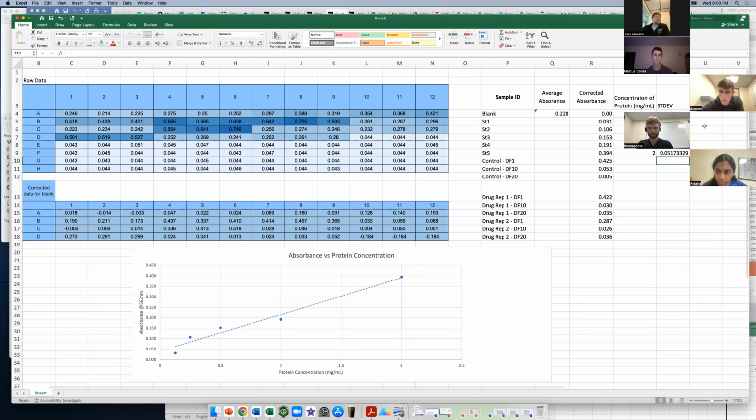Okay, everyone with me still? Yeah. So why did we not do the rest of them, like the controls and the drug rep 1 and 2? I think you guys are supposed to for the table, but I just showed you how to do it. Just keep doing it. Okay. Makes sense.